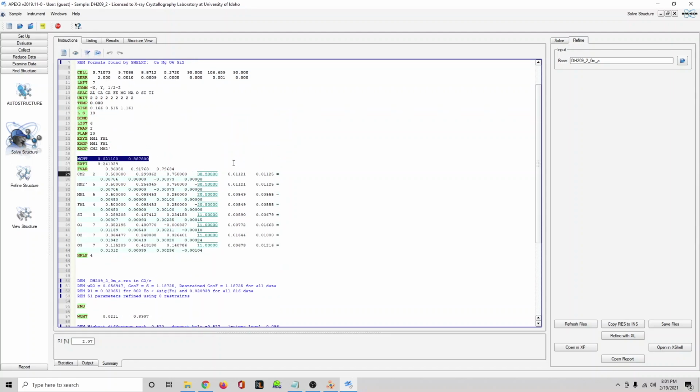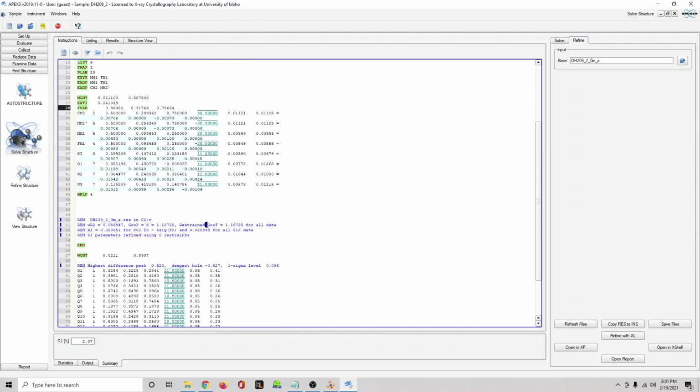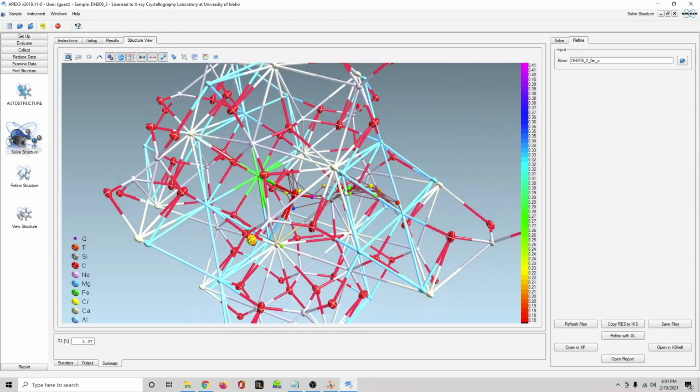So what should we do now? Looking at Q1, let's take a look at that just to check if the oxygen position is split in this pyroxene, or at least if it is detectable, because normally if the free variable refinement of anything that is split is less than 5%, you don't really model it because it's outside the ability of X-ray diffraction, even though I kind of just go with whatever.